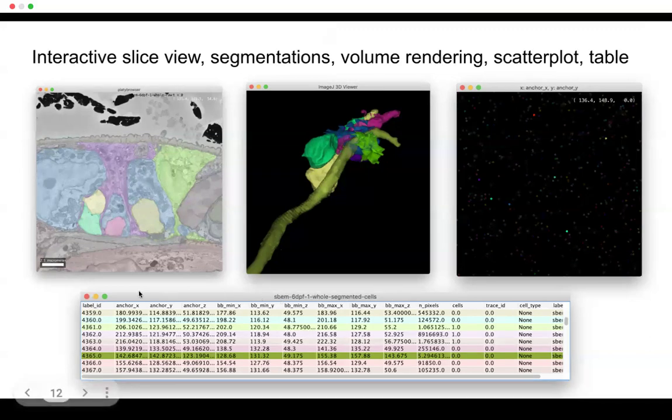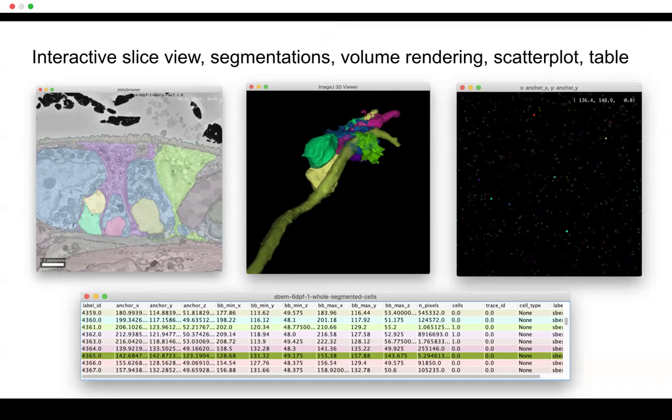Then another view we have is a so-called scatterplot view. So from the table, actually here, which for each row is one of these segments and you can have different measurements, morphological features or whatever, you can make a scatterplot and then see where they lie. So this is actually really useful if you want to learn, for example, about the morphology of the cells in your sample to have this way of visualization. And it's all linked. So if you click in the table, it would zoom in the different viewers on this particular cell and vice versa.